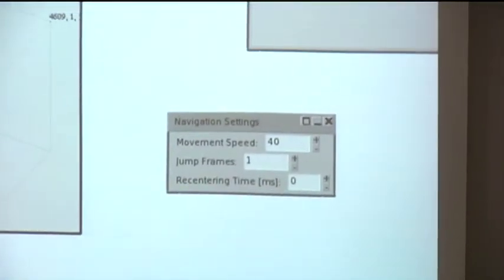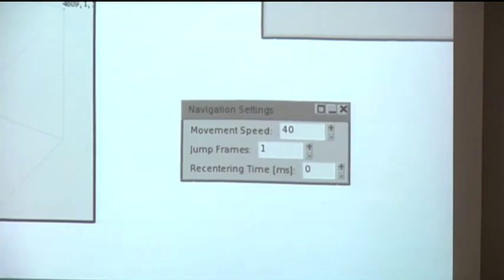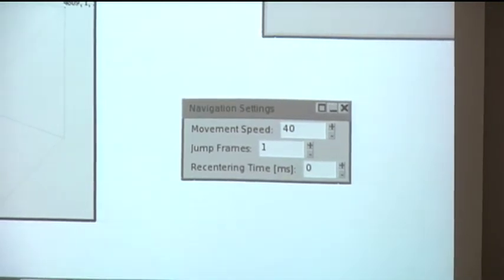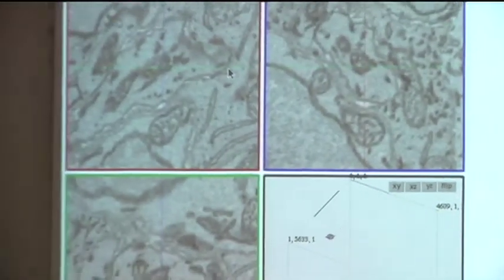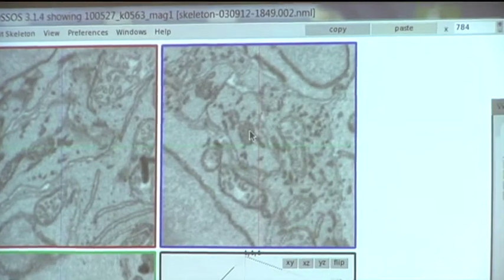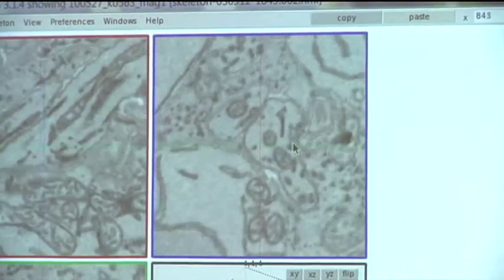Okay. So which are the controls? So the controls are F, right here. F forward, T backward, and the mouse to move. Okay. So ready, steady, go. Sorry. Okay, I cheated there.